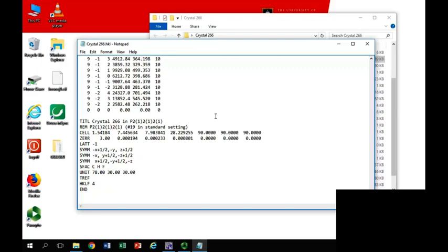It may give you better standard uncertainties, just because of the way the mathematics of it all works. But they're all this space group. They're just different settings. And I think there's one as well, I2 upon C, or I2A, which is a non-standard setting. So this is primitive and this is body-centered. But it's still P21 upon C. It belongs to that family of space groups.